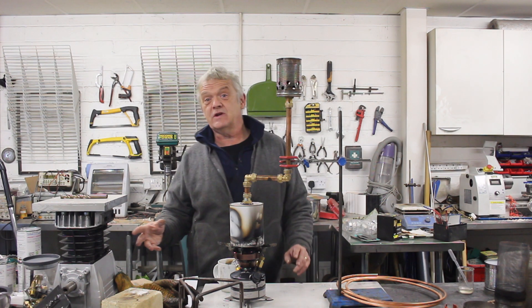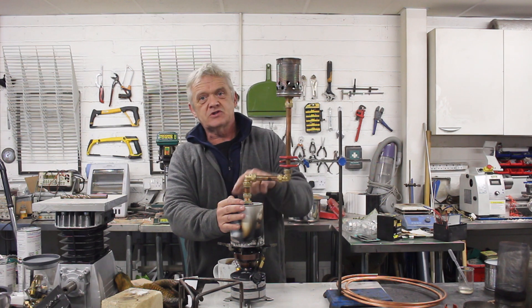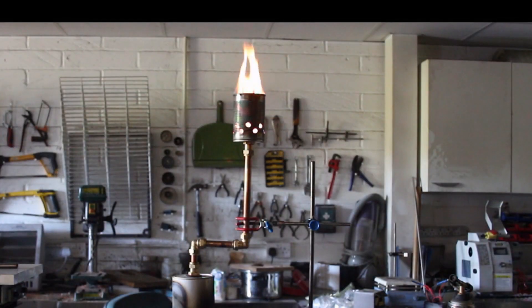Hi everybody, so in video 1707 we made this thing — it's really simple, it's just a paint can with some plumbing fittings going to this burner head, which is made from an old can of beans. We heated that up using a primer stove and drove some gas off there.